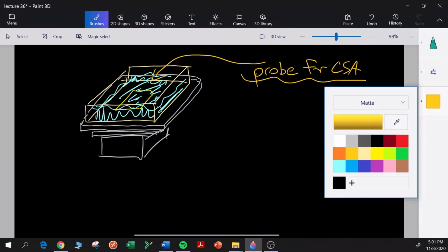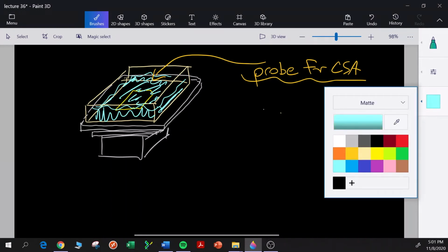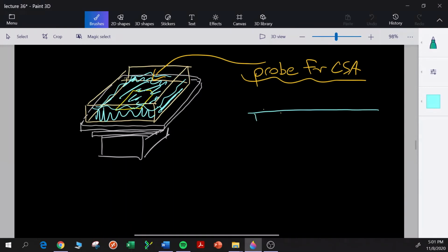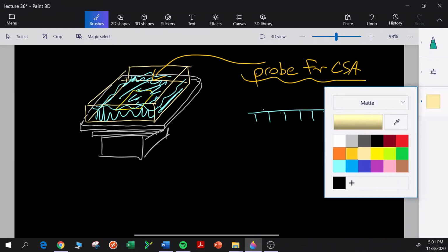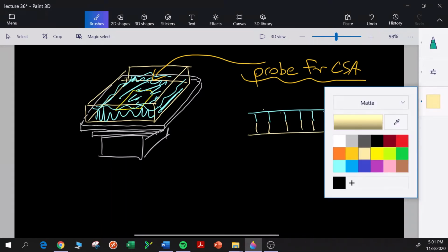And then what we can do the next day is see, well, maybe I should explain hybridization a little bit. So what's going to go on? Hybridization, what do I mean by that? So here's a section of our probe with the radioactive phosphates. I won't diagram the phosphates. Let's say here is part of a CSA messenger RNA that's stuck to the nylon membrane.